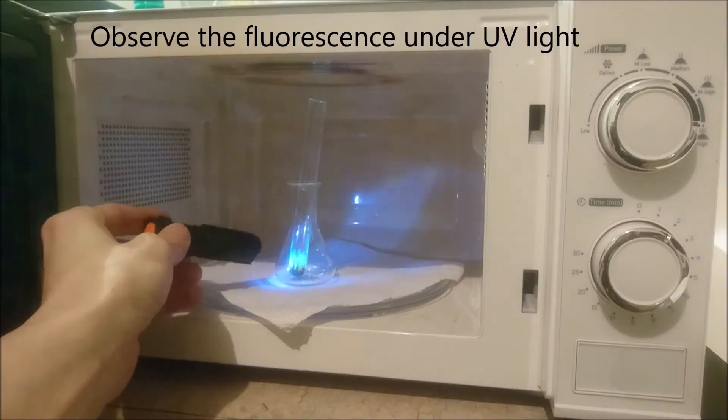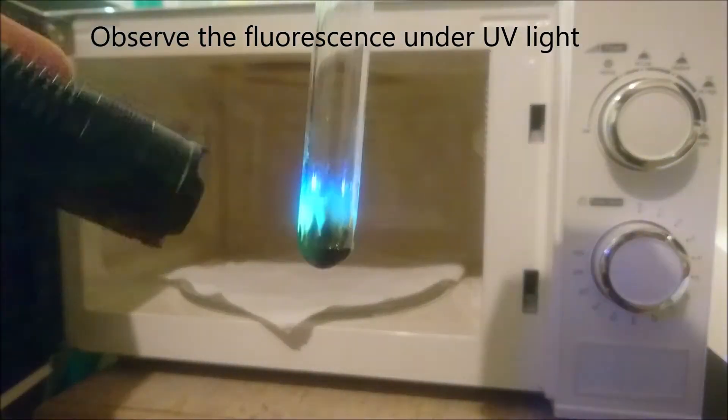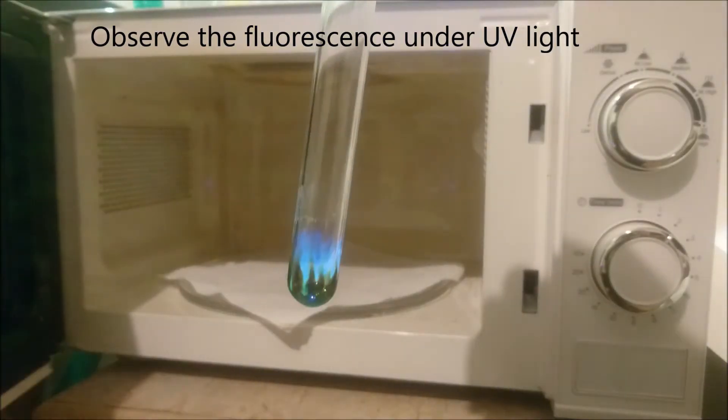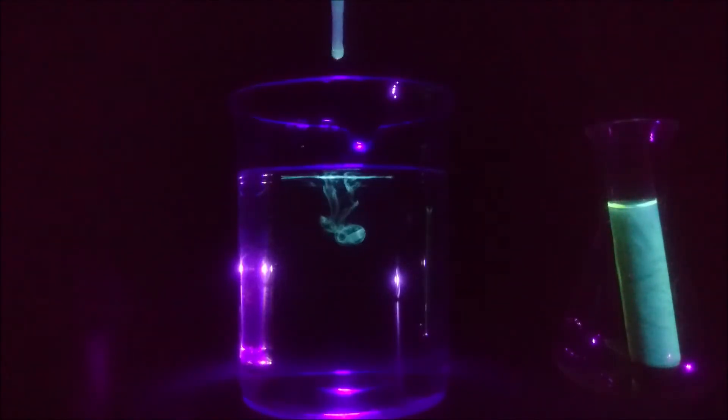Let the reaction cool down and observe the fluorescence under UV light. The color of the fluorescence is bluish when the UV wavelength of 380 nanometers is used for excitation, and it will become more yellowish under 405 nanometers UV wavelength.